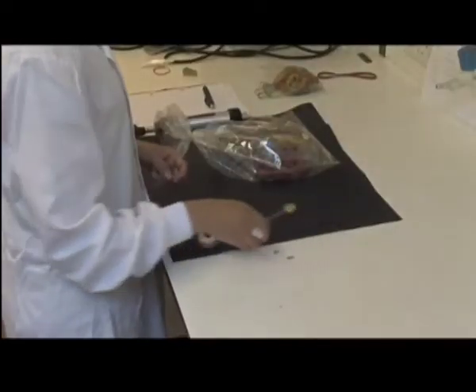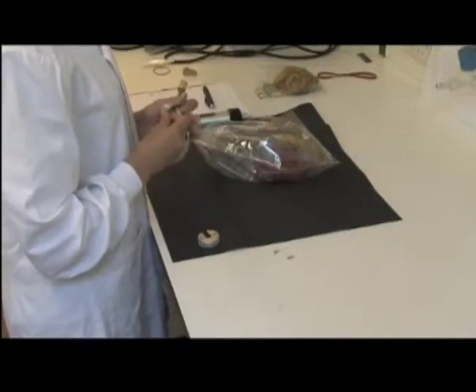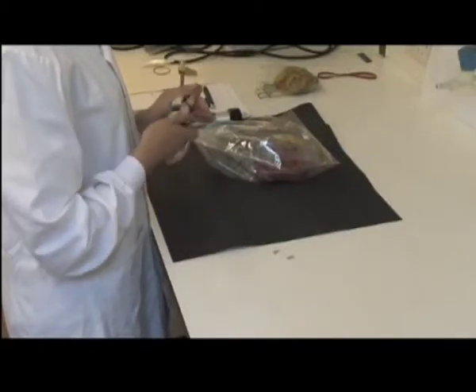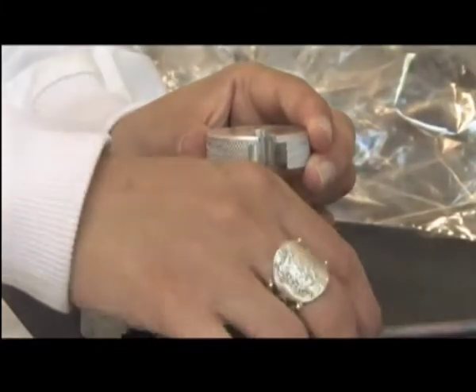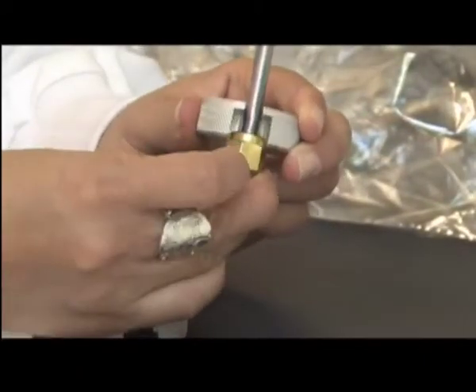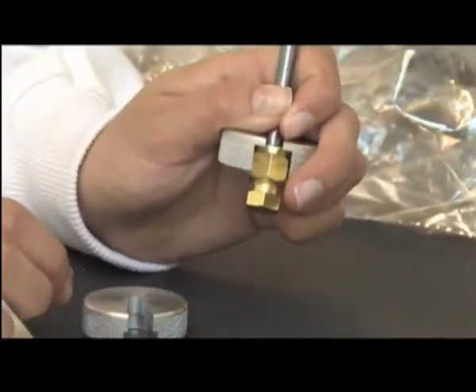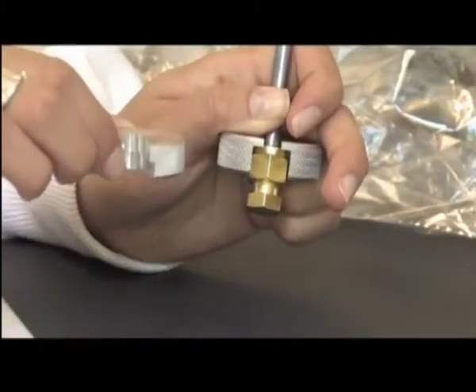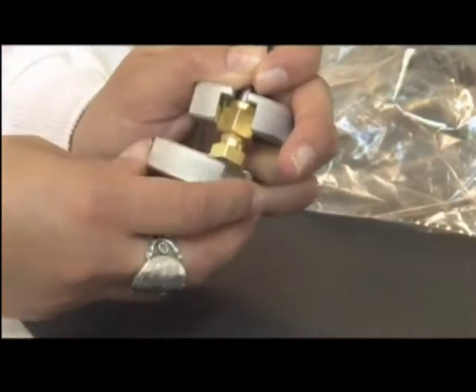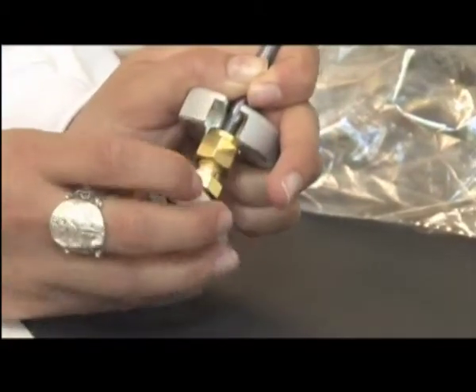Remove the seals from both ends of the sampling tube using the tool provided. Slide the disc with a deep groove onto the nut, and slide the disc with a shallow groove onto the cap. Twist the discs counter-clockwise against each other to open.